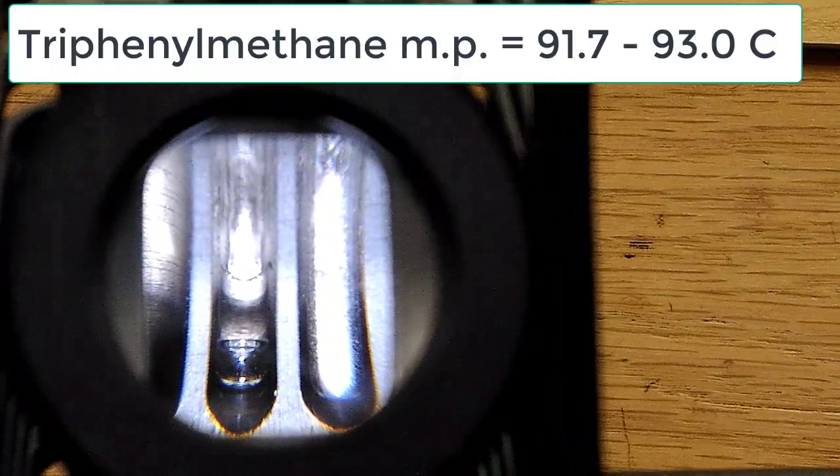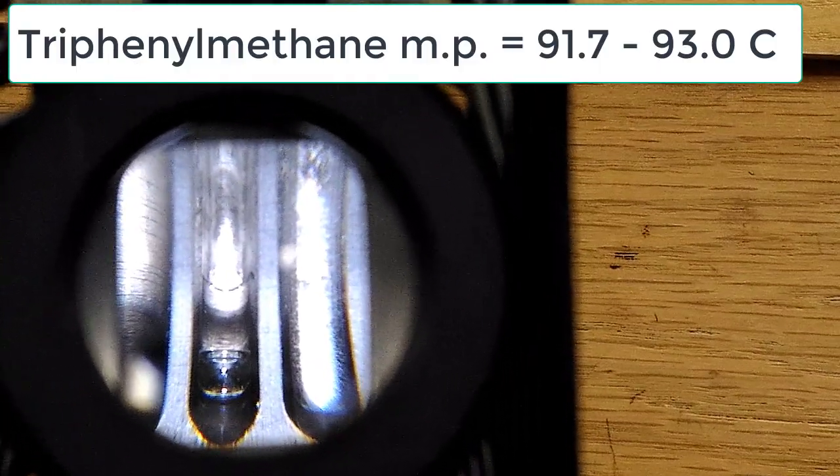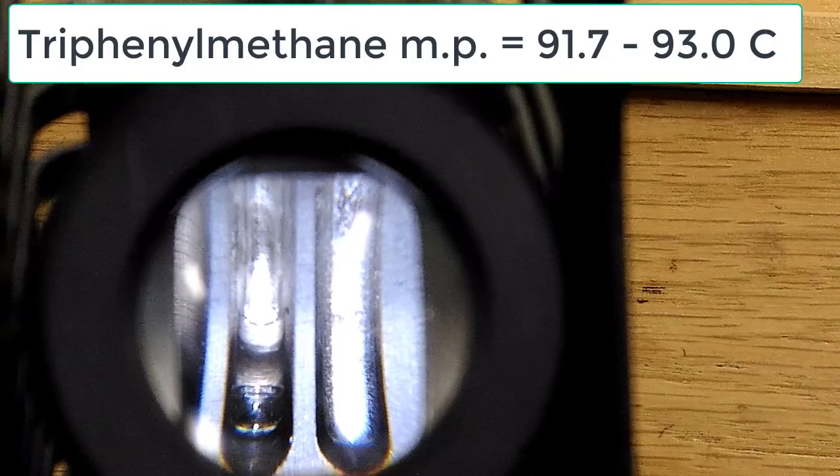Watching as the samples melt, you can determine which should melt first based on the expected melting point. We know the melting point of triphenylmethane is around 92°C. The triphenylmethane is observed melting in the range of 91.7 to 93 degrees Celsius.